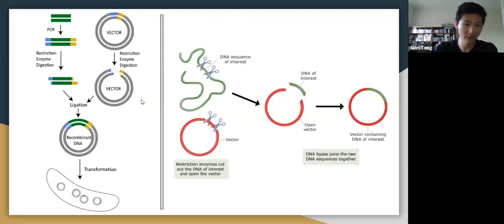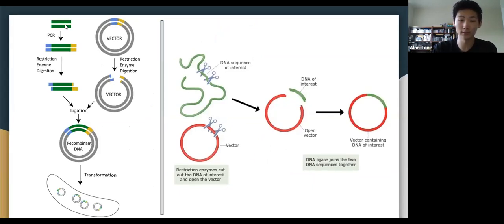Now here's the idea, the one that May alluded to earlier. We have some DNA that we want. This is our gene of interest. We do PCR. I won't go into PCR in this lecture, we might go into it later on, but PCR is a way of amplifying DNA. You make a whole bunch of it, and then you digest using your restriction enzyme. Digestion is another word you might encounter. You just cut it up. You use your DNA katana, and that chops off this point.